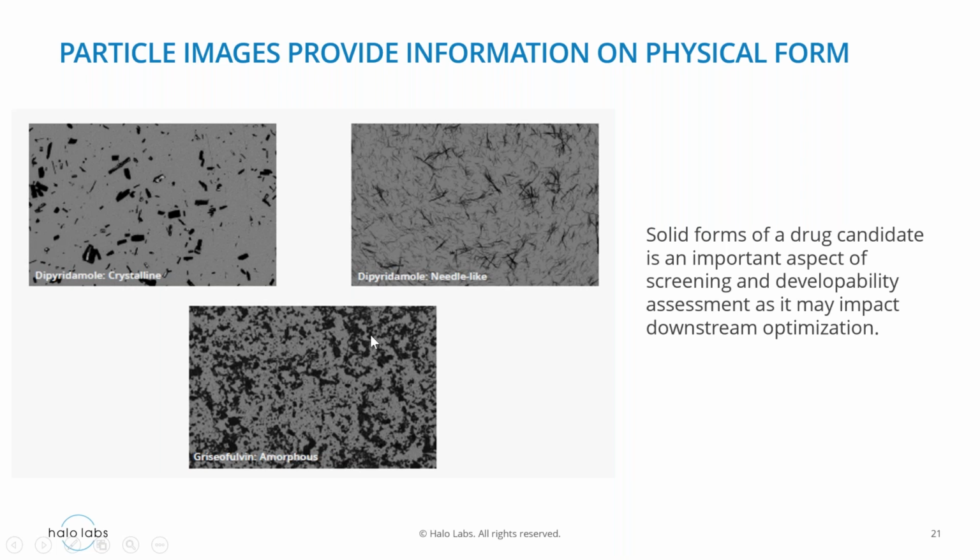All this is important because if you remember, what you want to see is if you can do the formulation to improve. So in this case, it would be hard to do formulation, but in this case, it would be easier to have a formulation so that you can put your drug into the market.